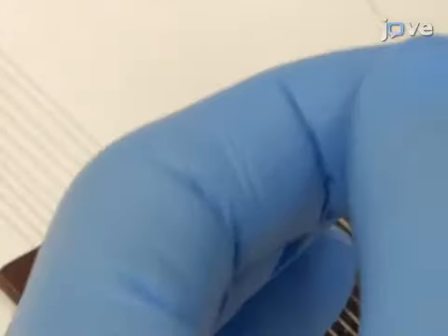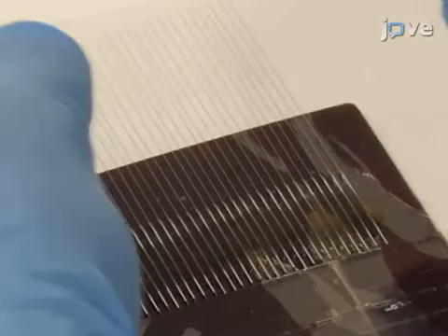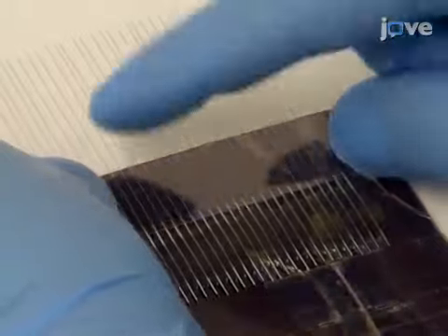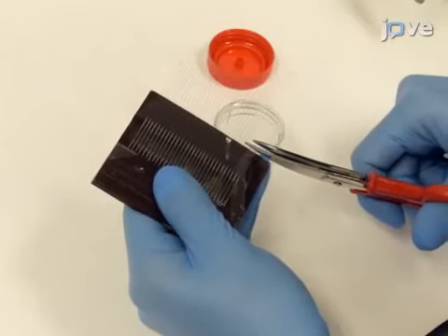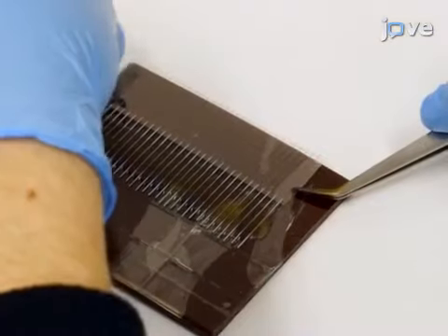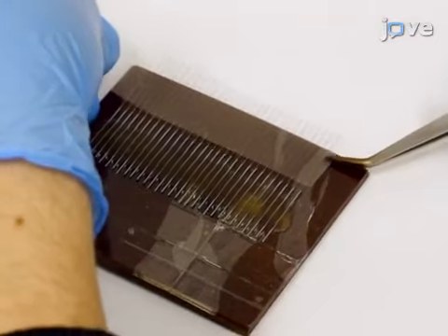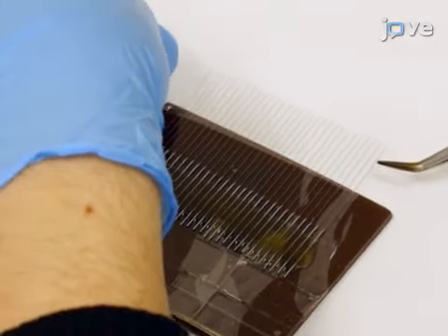To begin this procedure, place the tungsten wires in a custom-built alignment tool for cutting. Carefully attach the loose ends of the wires with adhesive tape and cut them to the desired length. Next, pull the tape gently in order to remove the tungsten wires from the alignment tool, making sure that all the wires remain attached to the tape.